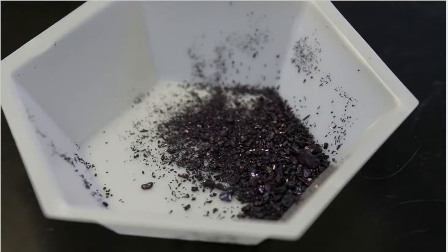All right, so a close-up of potassium permanganate is here. Again, it's going to look very dark to you, but there is violet and purple in those crystals. Depending on your screen and the color, we've all seen those images: what color is this shirt, what color is this shoe? And then a civil war happens because some people say it's green and some people say it's blue. Well, here's one of those colors. Depending on your screen, this might show up black, or it might show up a deep violet, dark purple.